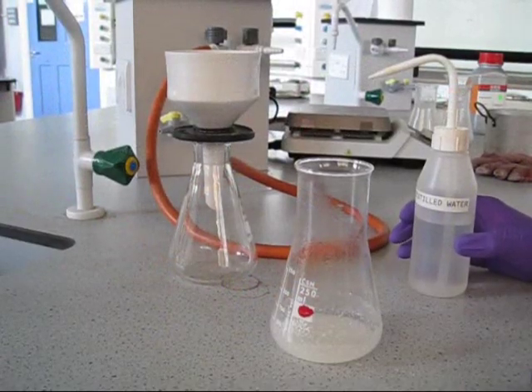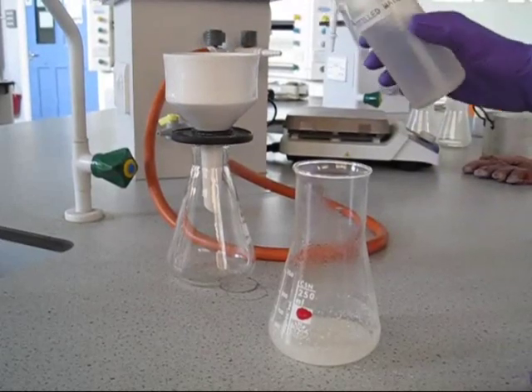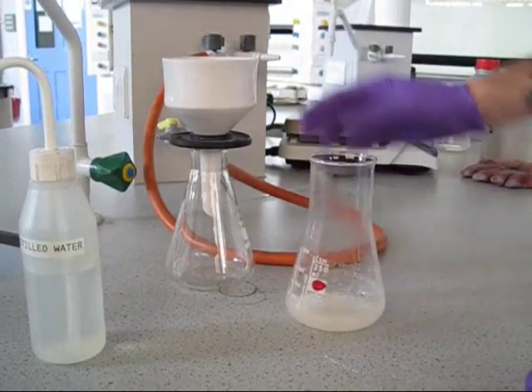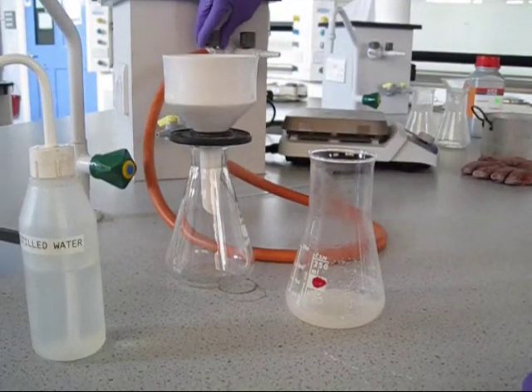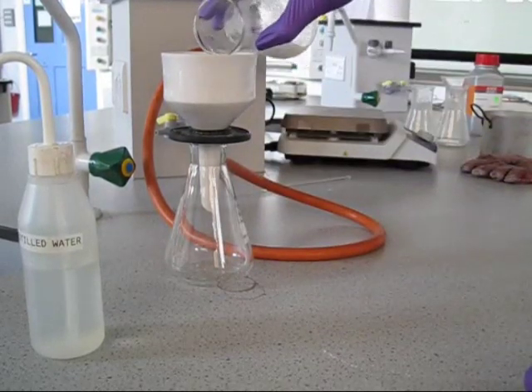Before we filter our recrystallized product, moisten the filter paper on the Buchner funnel with a little bit of the solvent, in this case water. We then turn on the vacuum tap, like so, and pour our recrystallized product through the funnel.